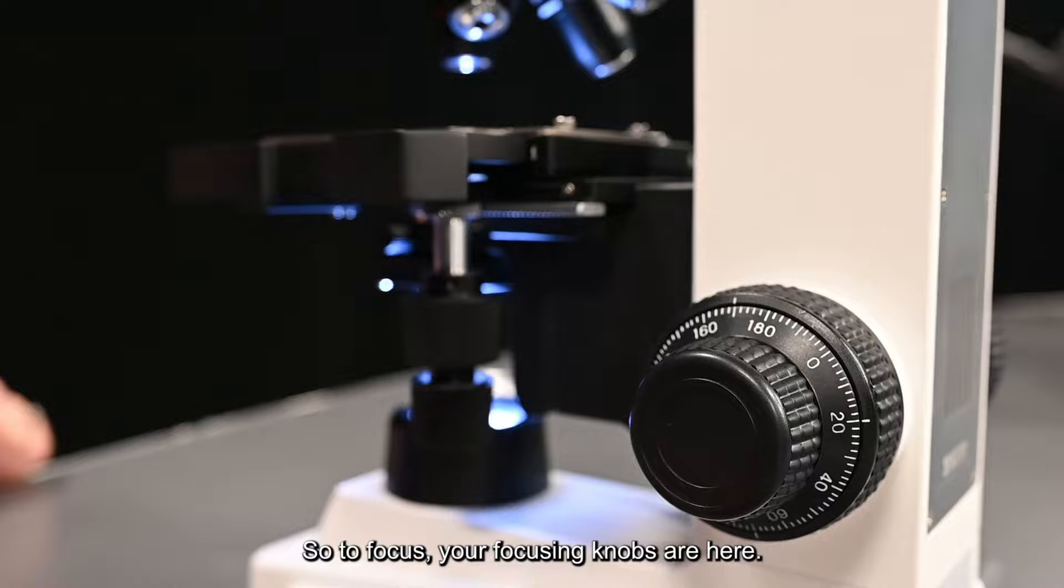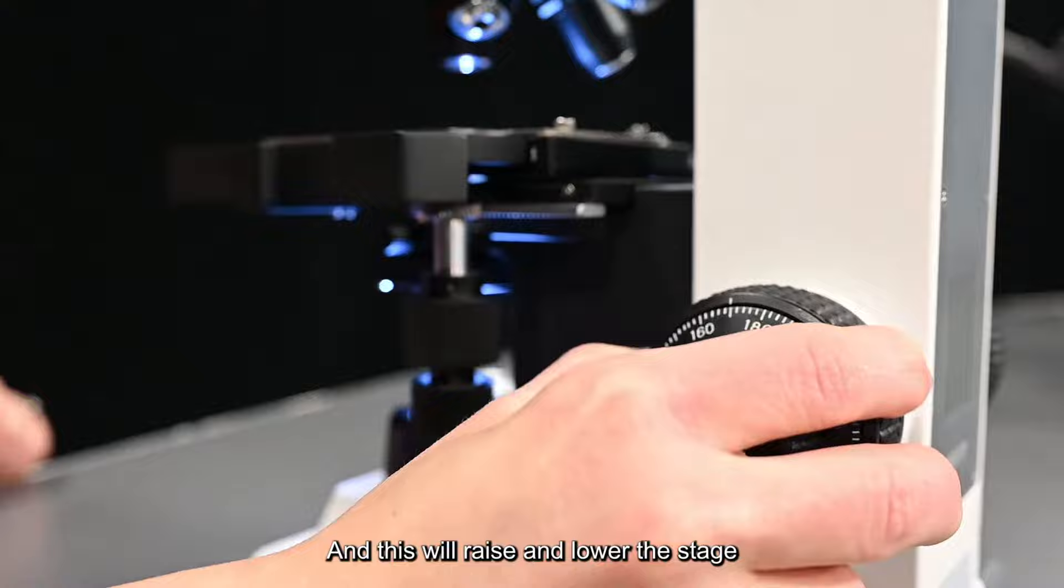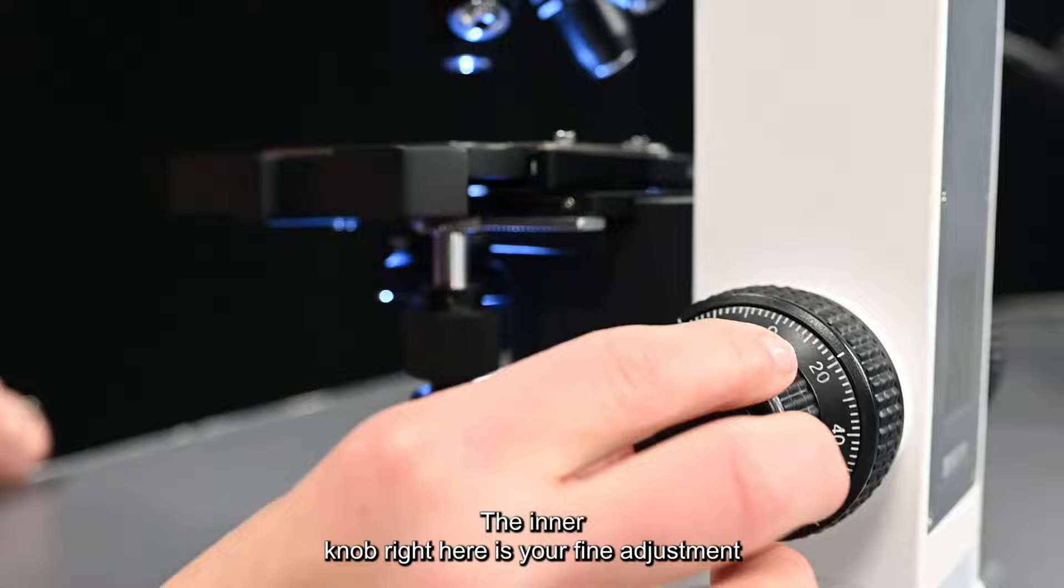To focus, your focusing knobs are here and this is actually a double knob. The outer part of it is what we call your coarse adjustment and this will raise and lower the stage to make really large adjustments to your focus.